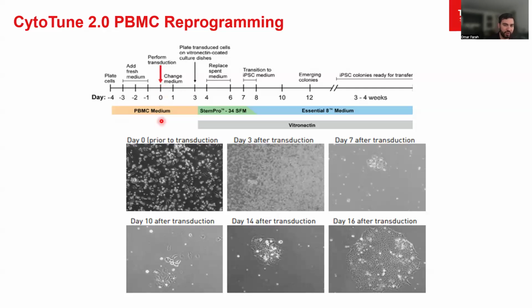And you'll see this protocol is slightly different, right? Because these cells are in suspension, for the first 3 days, you might actually start to see some cells that attach, but these cells aren't the ones, like Tyler was saying, that are going to reprogram very well. So we typically leave those behind, and we take the suspension-based cells.